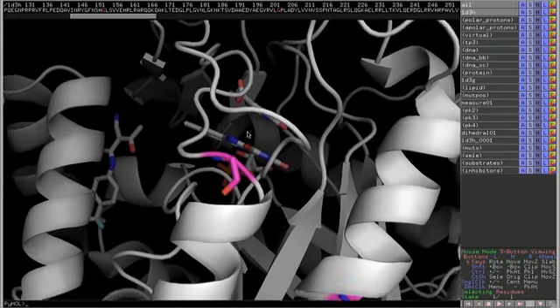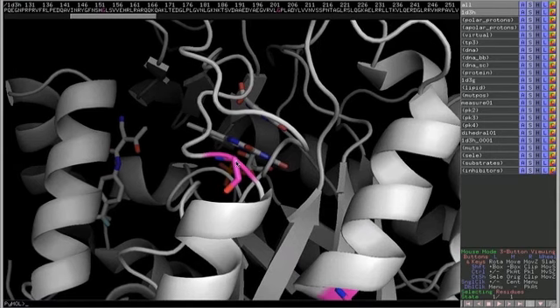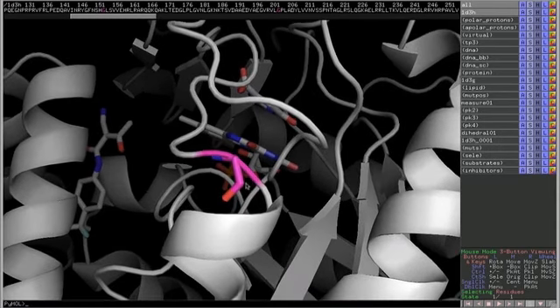One thing we can do, let's get a little bit more sense of what's going on right around the glycine. Within all these programs, you can define particular regions of the protein that you're interested in. So let's select the neighbors as being everything within a certain distance of that mutated position.